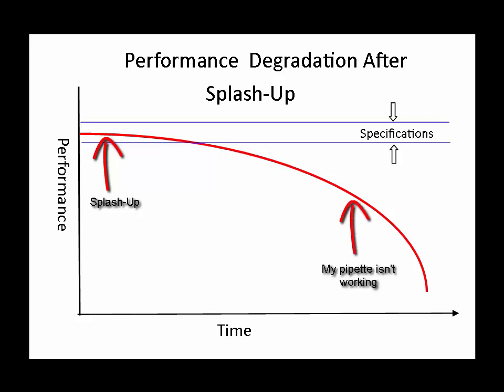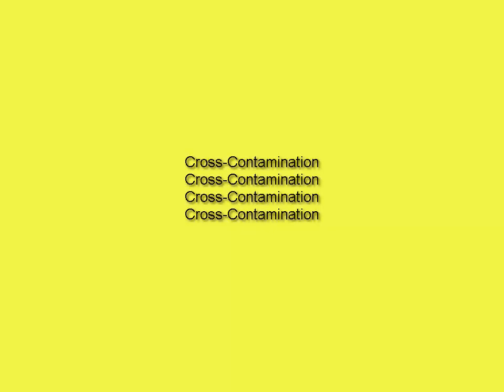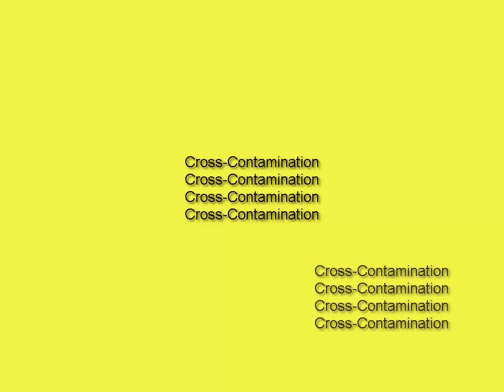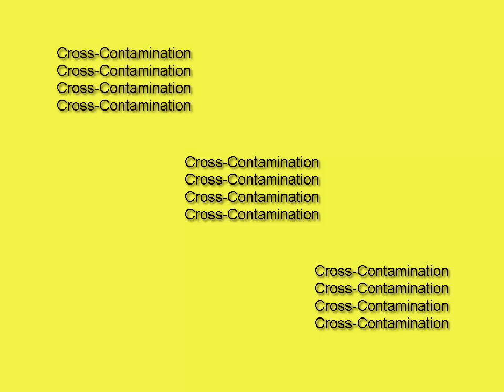By the time a researcher notices the pipette isn't working, it actually has been out of calibration for a very long time. The second reason to clean it out immediately is the pipette has the potential to cross-contaminate every subsequent experiment, causing seriously unreliable results.